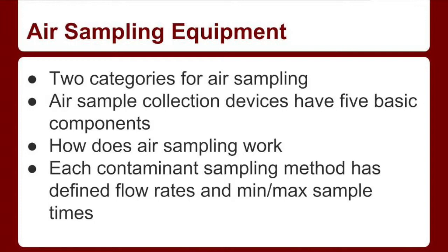The suction pump moves air through all of the components of the sampling train. The pump must be able to draw air at the required flow rate for the time required to collect the sample. The airflow rate is set using the rate control valve.